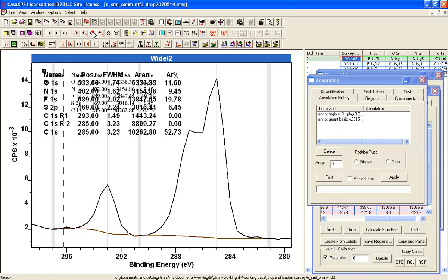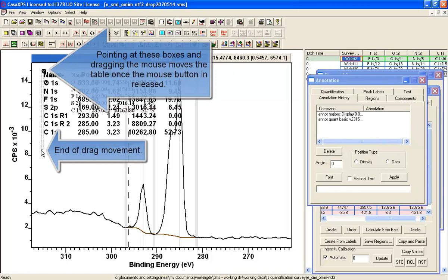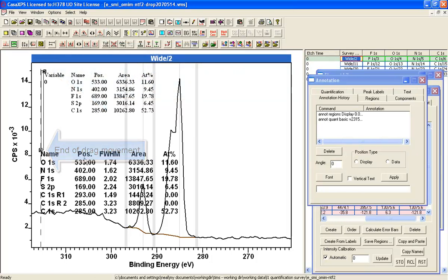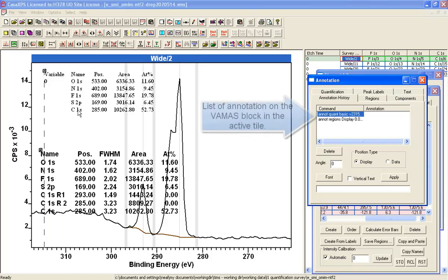And you can see I've got two sets of annotation. And what I need to do is just scroll out a bit because my region was overlapping that. If I now point at the annotation marker and move it, you can see that I've got two tables. One is the original one. And because I clicked on it, it's come to the top of the table here. And if I click on that one, it'll come to the top. And that's the one that I've just created. And this one now shows you just the carbon that is deriving from the region that had a non-zero RSF.